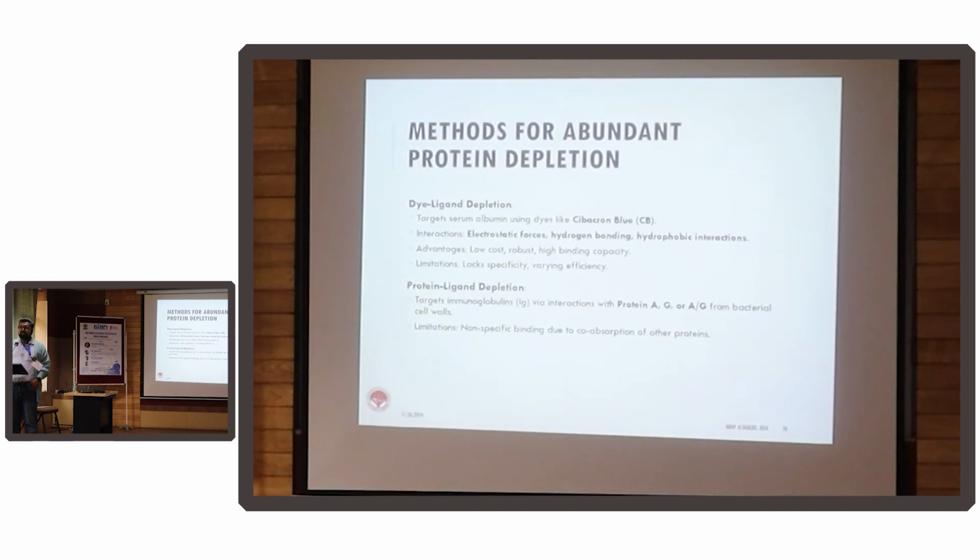If you can find a protein that can tell that this person is suffering from this disease, or like the work that we did at IIT Bombay, about whether this person will have severe COVID or non-severe COVID. But this is a clinician who will come to you and ask very direct questions. They won't spend much time understanding how the mass spec works. And so as a scientist, you have to take care of it, how the mass spec works, and give them 1 or 2 proteins, or maybe a panel of 3 proteins, that can effectively prognose or diagnose a disease.